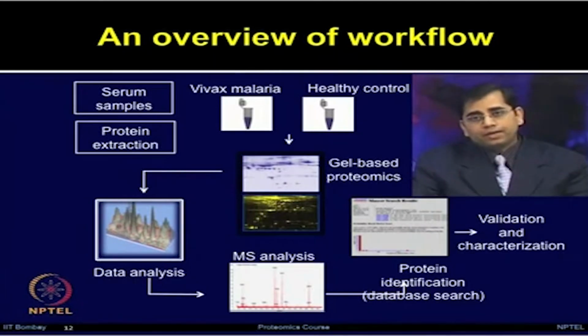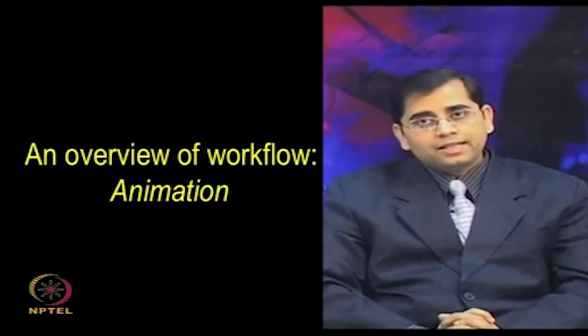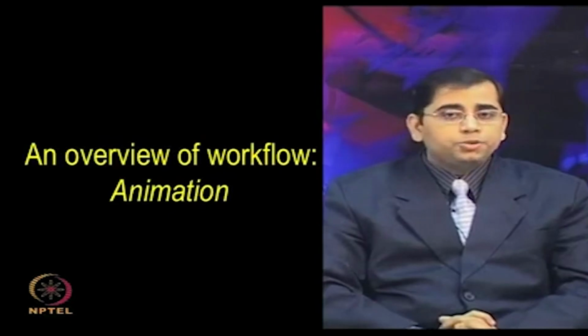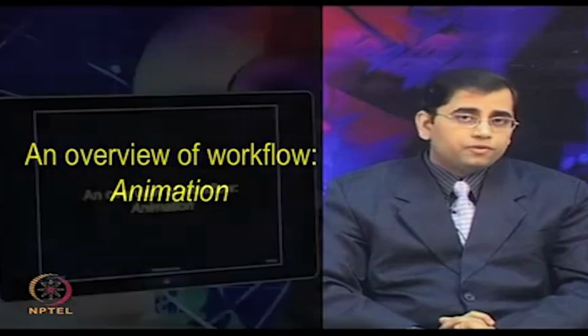Further, we validated a few targets and analyzed the data for various pathways which could be involved in such disease. Before we move to details of various experiments performed in this study, let me show you this animation to give you an overview of the workflow followed in this experiment.